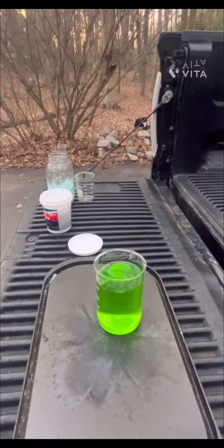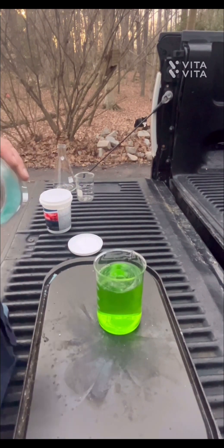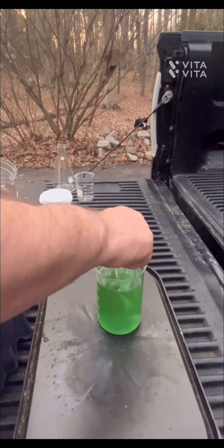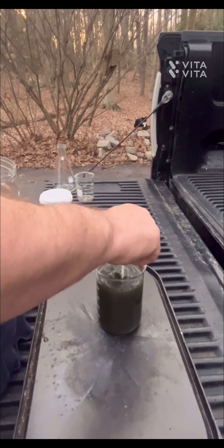Clean the spoon off. Put a little bit of that fresh iron sulfate in — just do a little teaspoon of that. Man, look at that go — that's amazing!